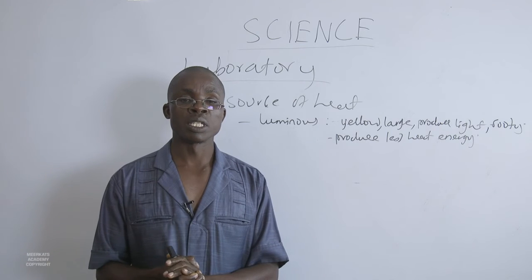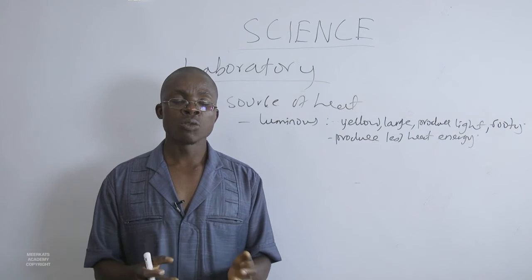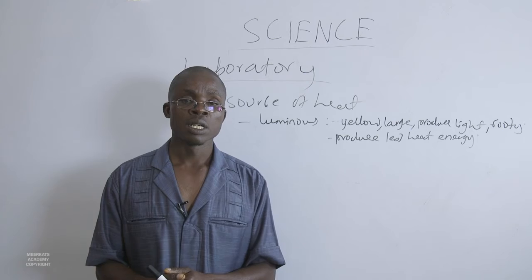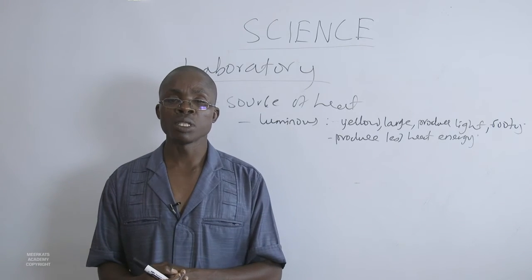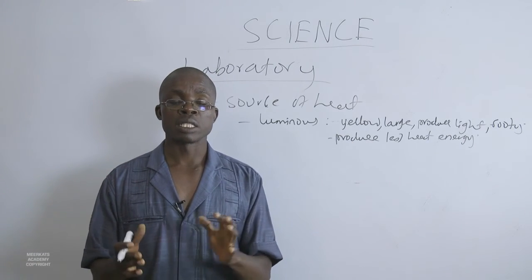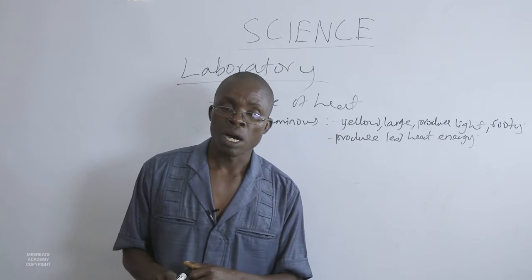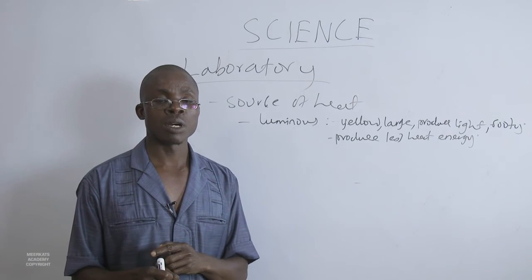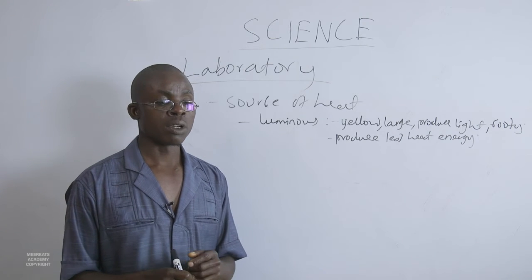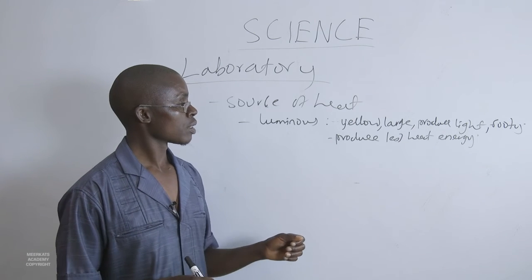But in case you are in a dark place and you want to see something, then this one comes out to be the best flame because it produces a lot of light and it is large enough to produce that light and feel comfortable at that point that was once dark, and now you are able to see whatever you wanted to see.